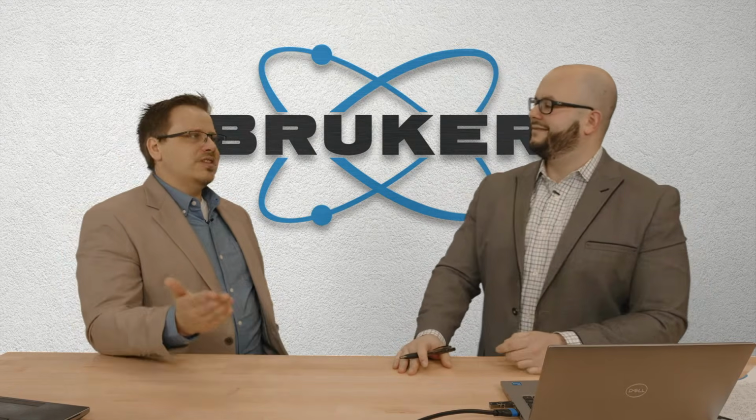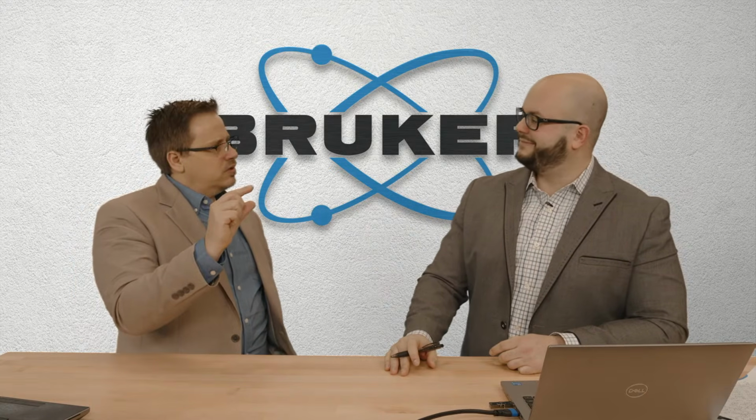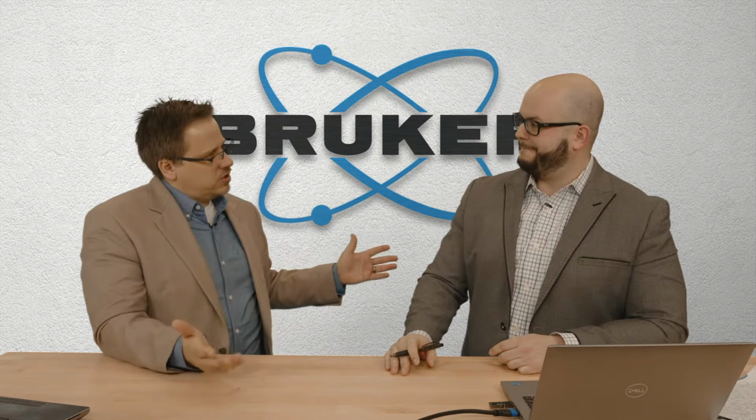It's all lambda equals 2d sine theta. At the end of the day, it's just Bragg's law. So a very small shift of the d-spacing yields a very large theta change.